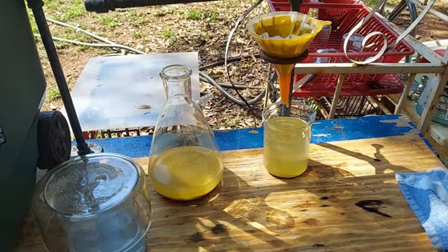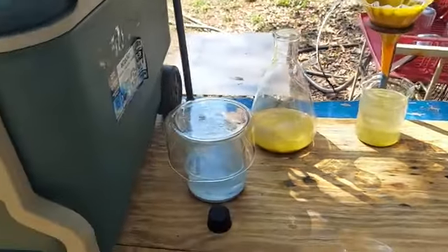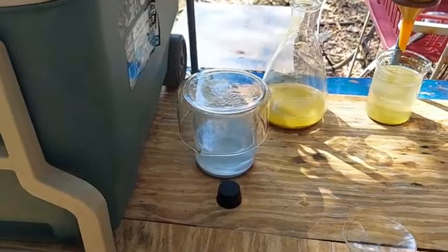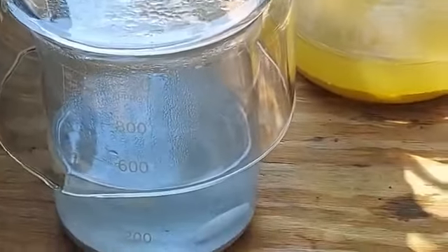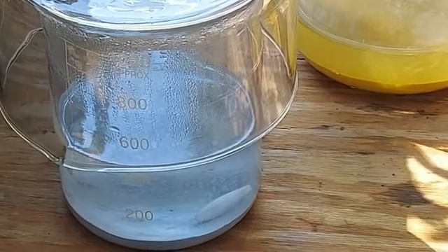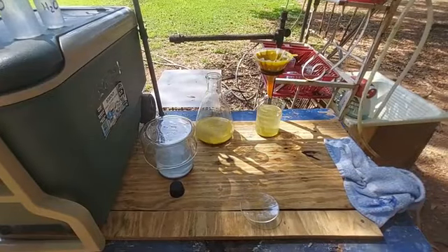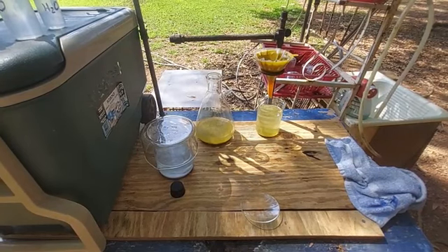Okay, so here's the deal. Right now, I am filtering off the mercuric oxide so that I can rinse it, flush out as many impurities as possible, and then we will redissolve that in nitric acid. Separately, we will take the precipitated mercury, which we have down here. See, it's very nice. It's just a gray powder. And we will dissolve that in nitric acid. Then we will take these two solutions of mercuric nitrate and we will precipitate out mercuric oxide again from both of them.